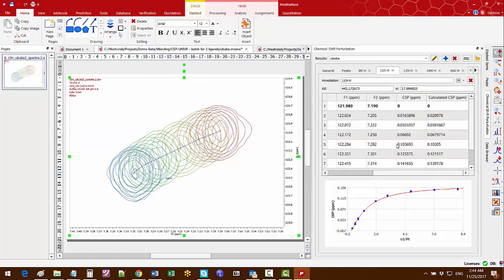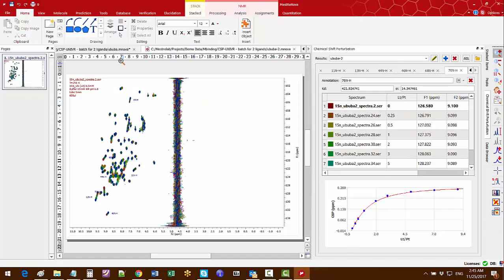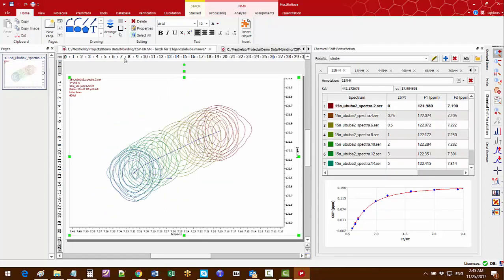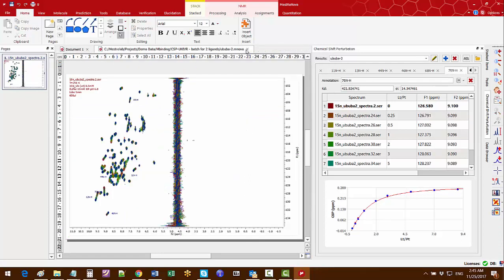You can see the similar results of the other ligand by switching to the other document tab. If you made any changes you can click the save tool to save the changes and click the cross button to close it.